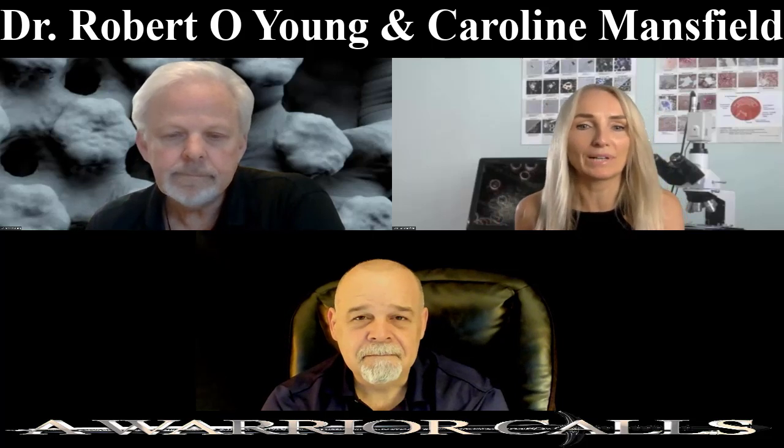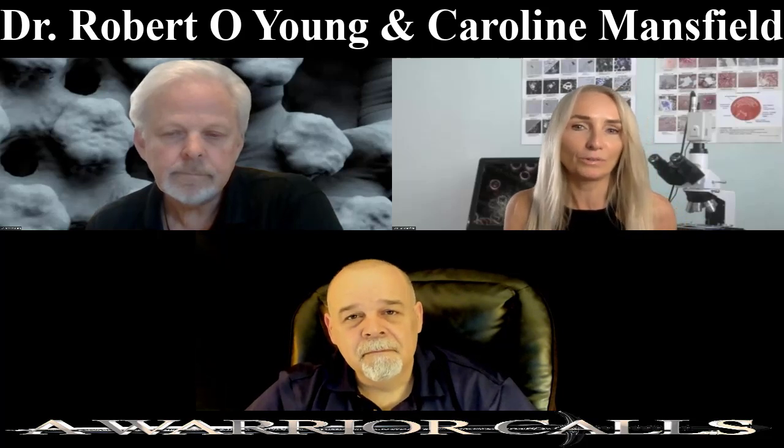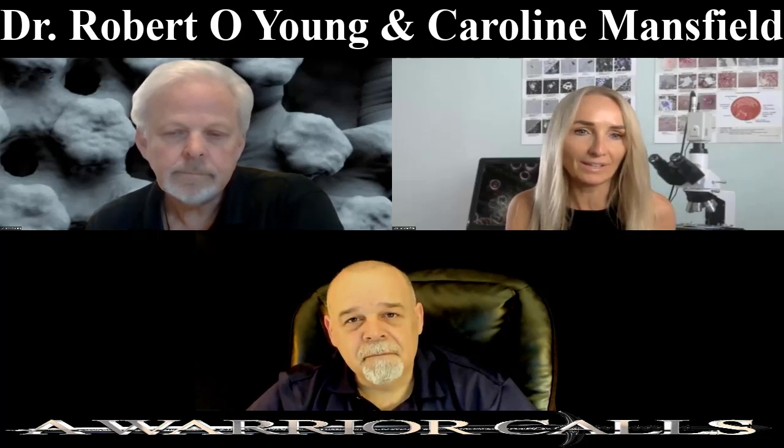Thank you so much, Christopher. Yeah, I just want to go over some slides today that I think people would find quite interesting. It's really just going over what we can and can't see using Darkfield microscopy. Because as a Darkfield microscopist for over 25 years, my training has just been what we're looking at in blood, and anything other than that, I haven't had training in. And most Darkfield microscopists wouldn't have had that training either.